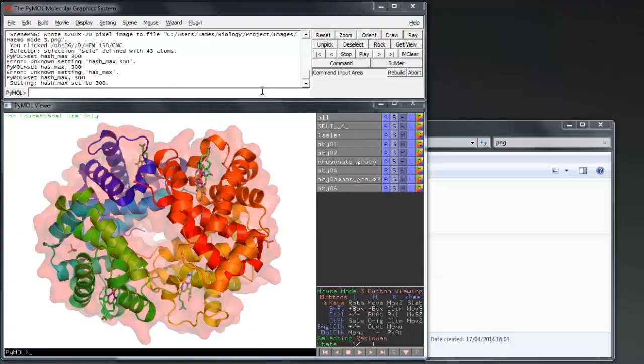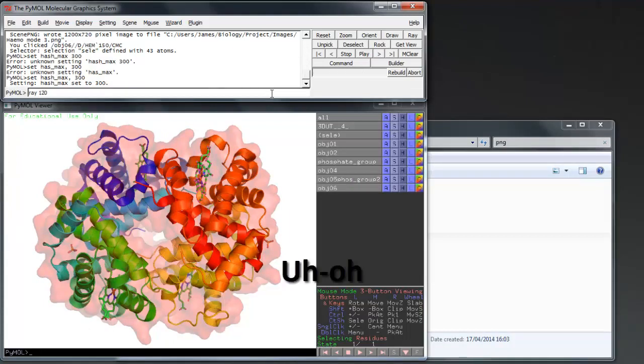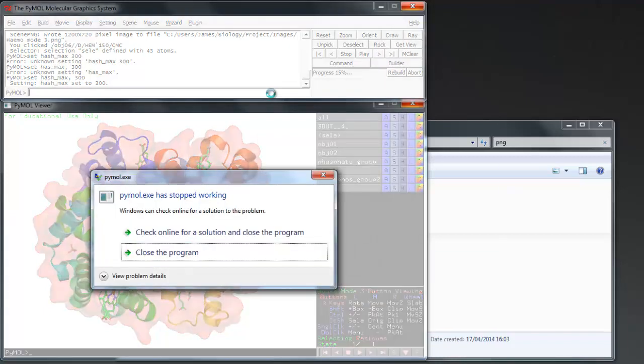If your ray trace crashed your PyMOL or took too long, firstly try zooming in a little to your object. If it still crashes, we will have to change the hash max.